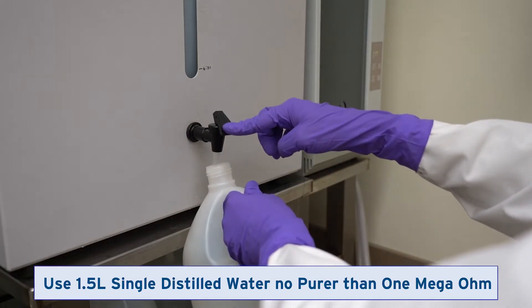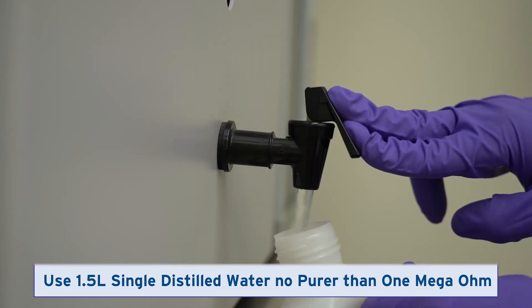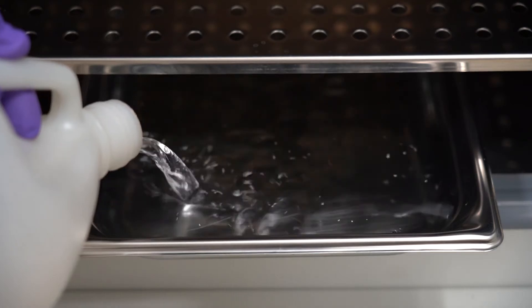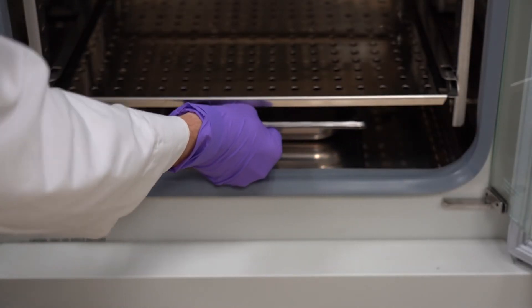Obtain 1.5 liters of single distilled water, no purer than 1 mega-ohm. Pour the water into the water pan while it is placed on the bottom of the incubator chamber. Slide the water pan back to the center of the chamber bottom.